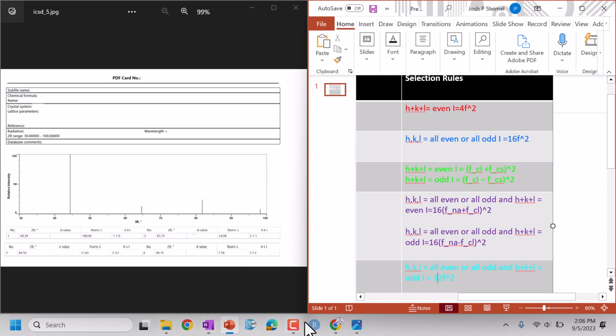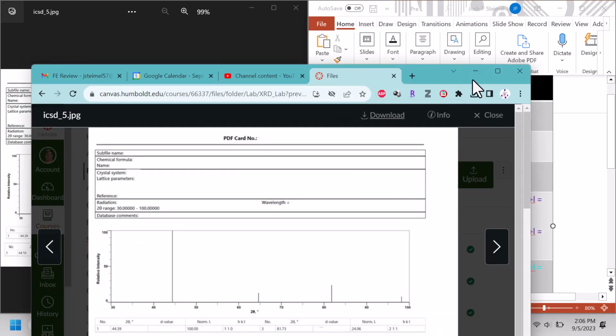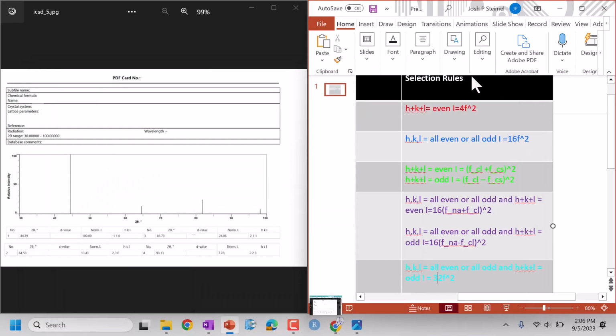Let's look at one more just to kind of hammer this home. And again, it would be nice if you had something pop up where, for example, to destroy this argument, I would have a little circle pop up in your presentation to kind of illustrate that this violates those laws.